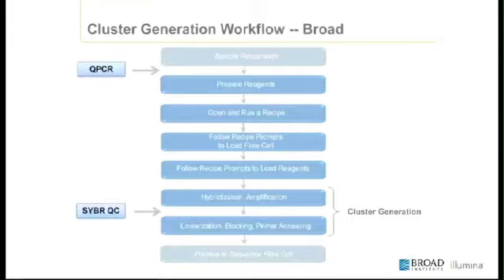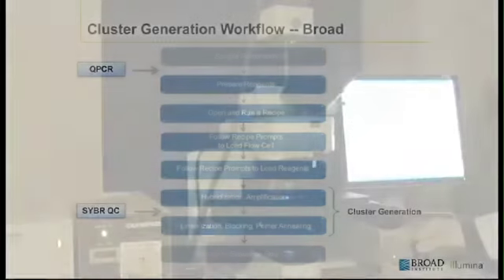Because we're such a high-throughput lab, we have a dedicated SYBR cluster station in a small darkroom with a microscope. You can also use a fluorescence scanner like GE's Typhoon Imager. The point is to be able to visualize the clusters in a standardized way. After cluster amplification, we move the Flowcell to the SYBR cluster station. We flow SYBR through the Flowcell, followed by scan mix.